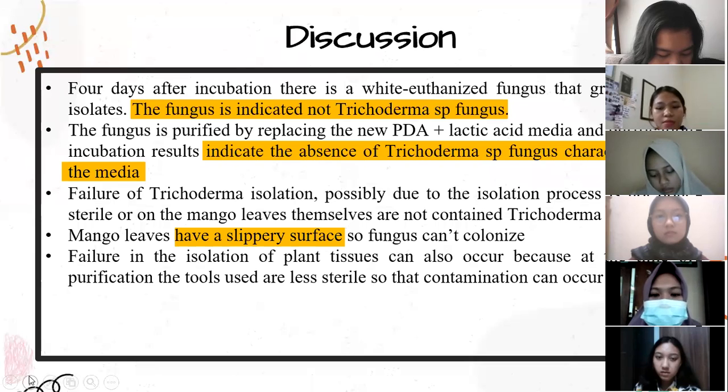Okay, this is our discussion. 4 days after incubation, there is a white antagonist fungus that grows around the isolate. The fungus indicates it is not Trichoderma sp.